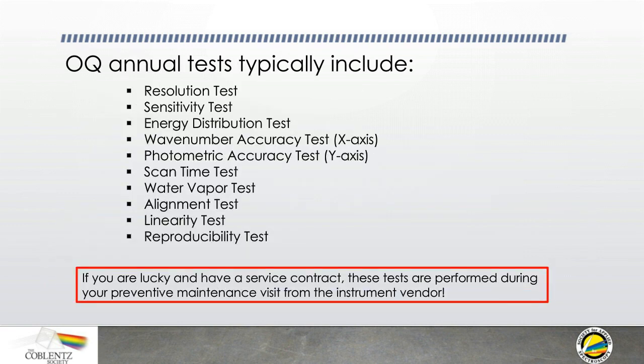The OQ tests are performed annually or after some major repair that's done. And here there's a lot more that is done with the tests. And typically this is done by a service engineer. As it says, if you're lucky and you have a service contract, the engineer comes in, he does the preventive maintenance, and then he runs the tests and you have the results.